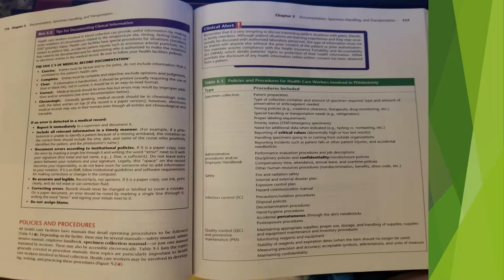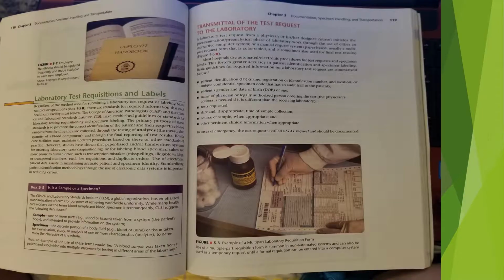Procedures included are maintaining appropriate supplies, proper use, storage, and handling of supplies, supplies and equipment maintenance and inventory procedures, monitoring reagents and equipment, stability of reagents and expiration dates when the item should no longer be used, measuring precision and accuracy, acceptable symbols, abbreviations, and units of measure, maintaining confidentiality.